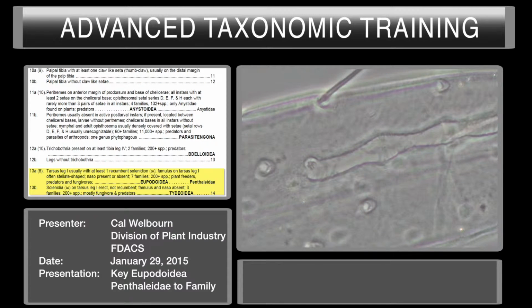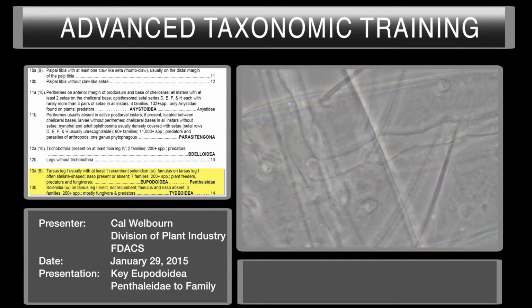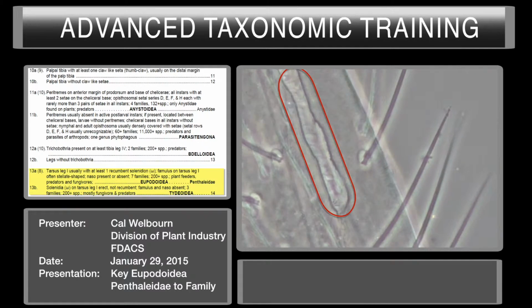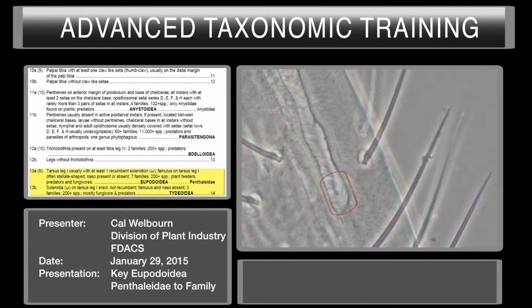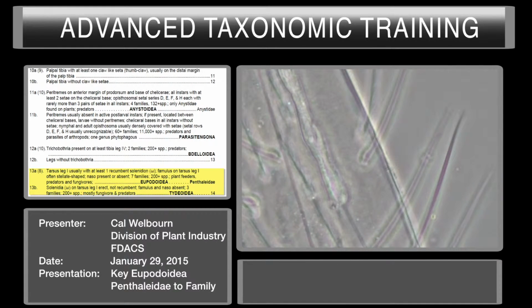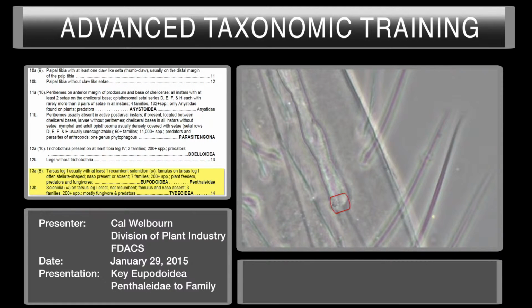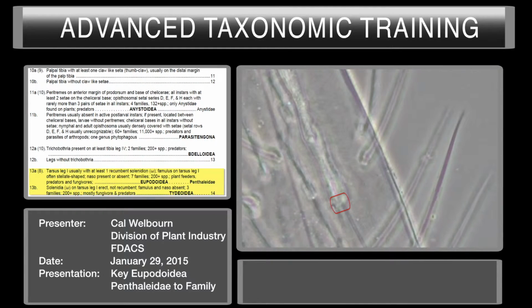Now we'll move to the other side, other leg 1, and see what it looks like over there. All right, we're on the left side of the left leg. This is tarsus leg 1. Here's this trough where the recumbent solenidia are. And one base is right about there. Another base is right up in here. There's the base right there. Can't really see the solenidia. But what you can see down here, focus carefully up and down, you see the stellate famulus.